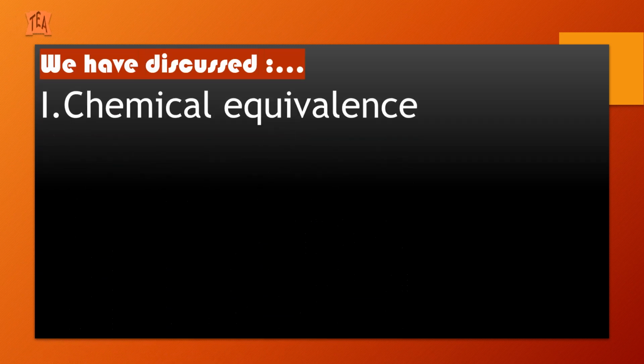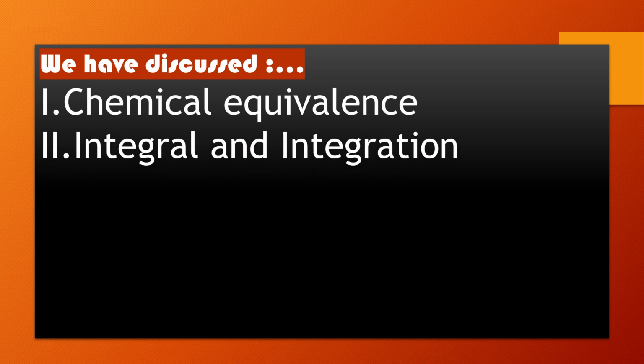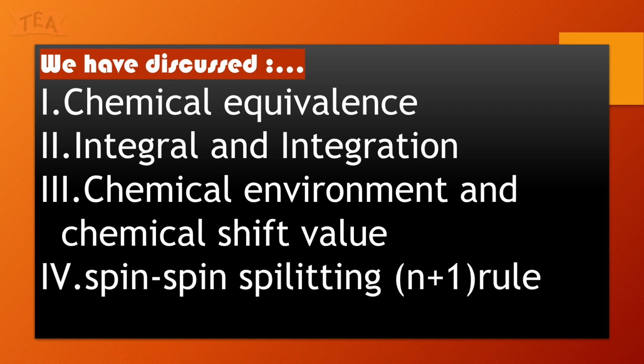Till now I have discussed briefly some important topics in H NMR series which are required to solve simple H NMR problems. So we have discussed chemical equivalence, integral and integration, chemical environment and chemical shift value, and spin splitting, that is the n+1 rule.